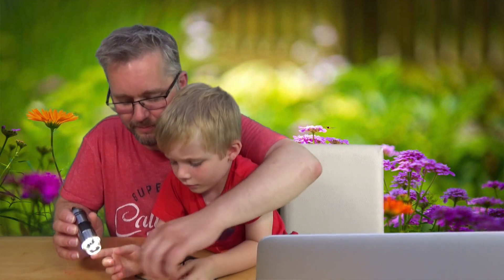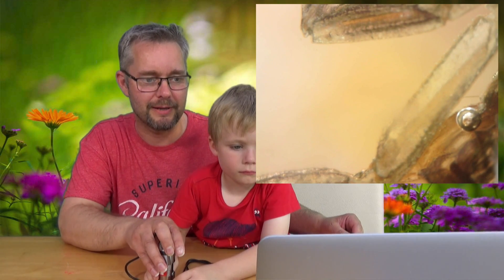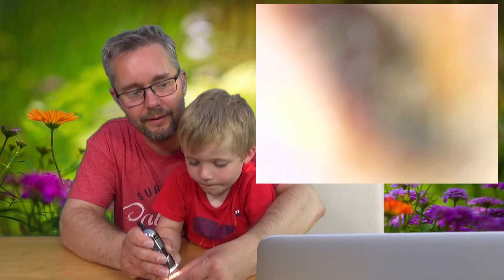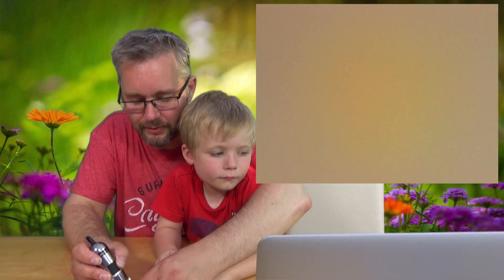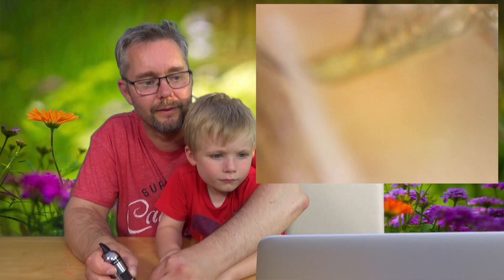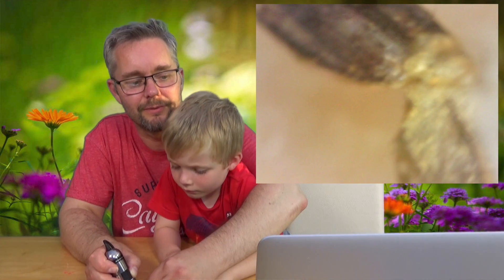Are you going to have a look at that then? That's something we got from a magazine. That's a scorpion — a tiny little one. It came with a magazine about creepy crawlies or something. Let's see if we can get it to focus properly. You can see its stinging tail. There is the scorpion's stinging tail — look at that. That's what it stings you with — see that little spike there? I've never seen a real scorpion, only on TV.